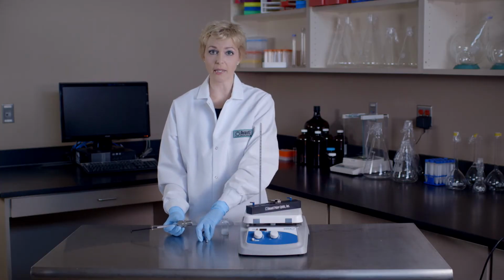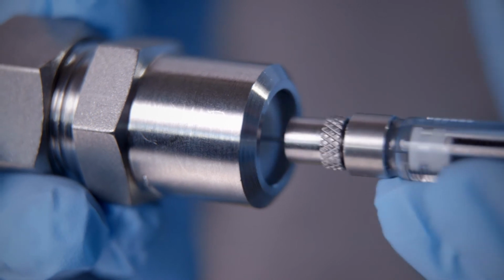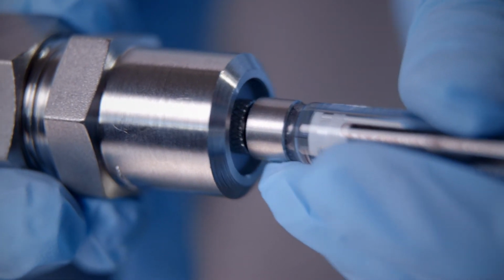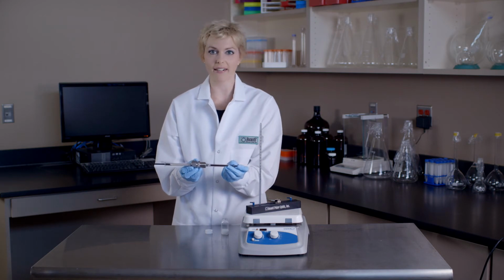Next, we will add our empty gas-tight syringe to the other side of the mini extruder, making sure the plunger of the empty gas-tight syringe is set to 0. This syringe will begin to fill automatically as the lipid is extruded through the membrane.